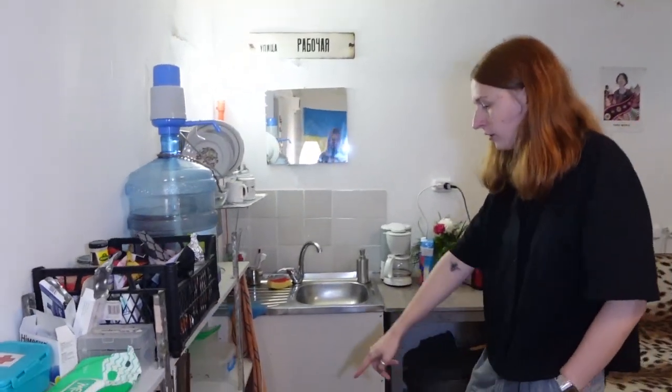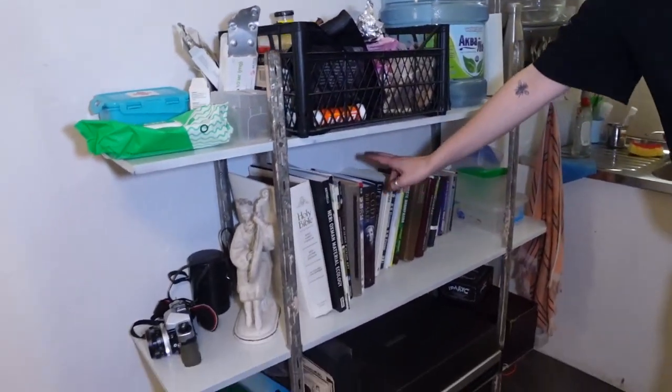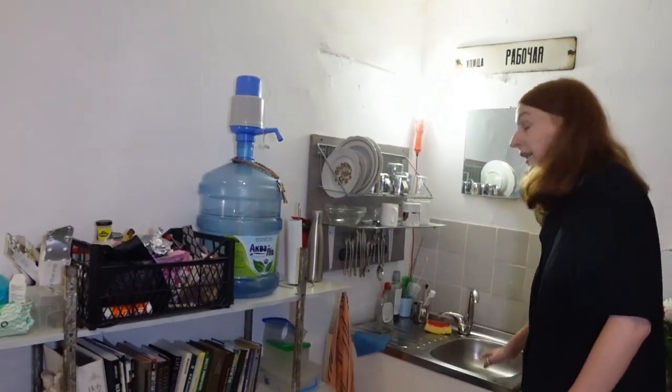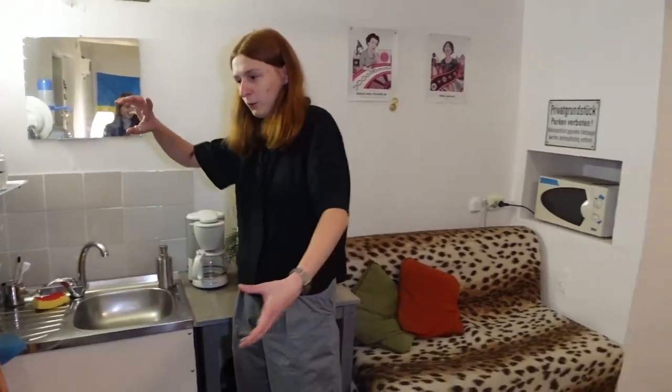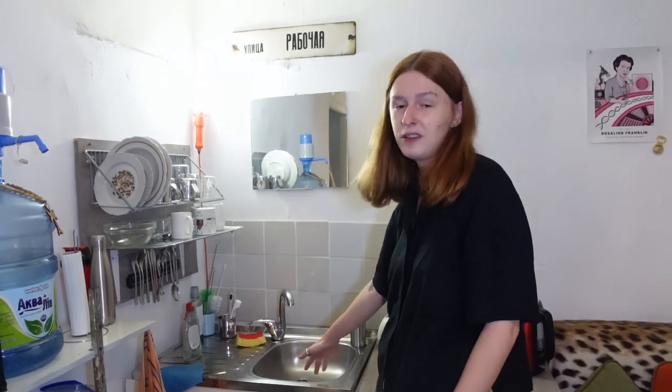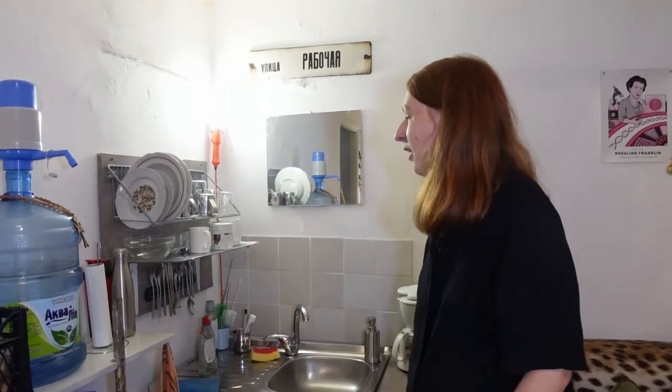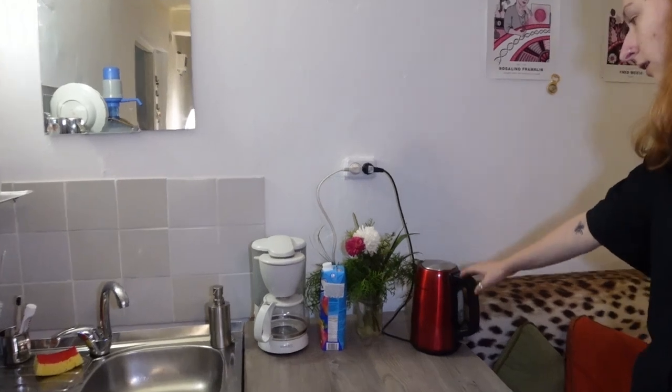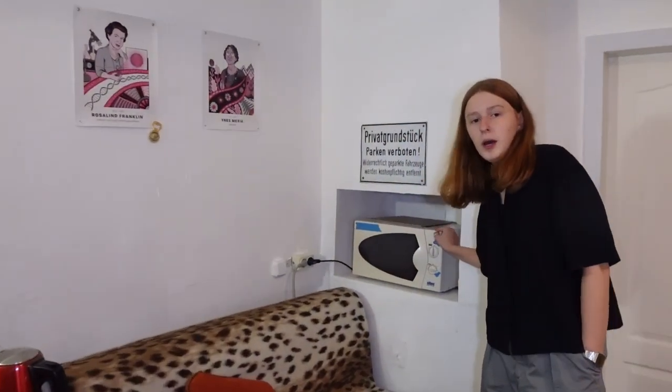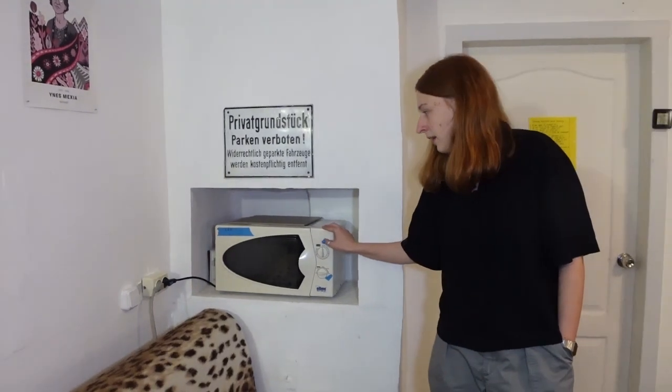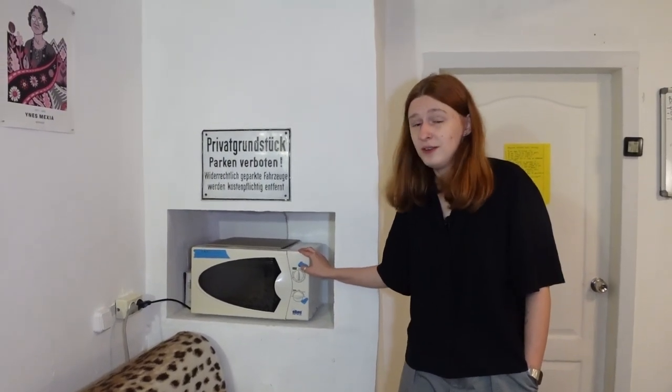Here we have my record player, some books, The Code Breaker of course, there's some food. We have a sink finally because last time we didn't have it. We had to fill the water all the time from a tank which was really annoying. So now we have an actual functioning sink with hot water which is a privilege. We also have coffee making and teapots, and a microwave for preparing agar media for bacteria and of course not for food use, never.